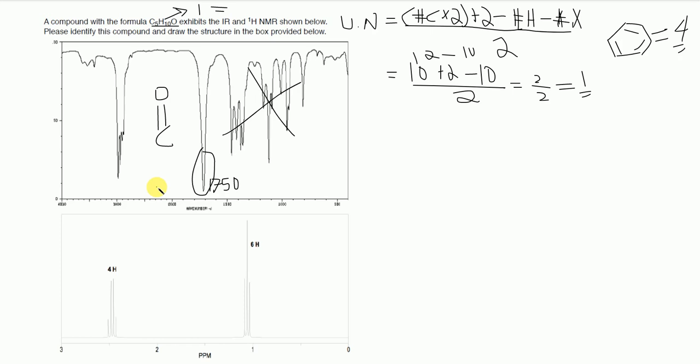And now I'm going to look at the NMR. So now I'm going to show you the way we look at this. It's a puzzle. So I don't have anything electronegative, okay?